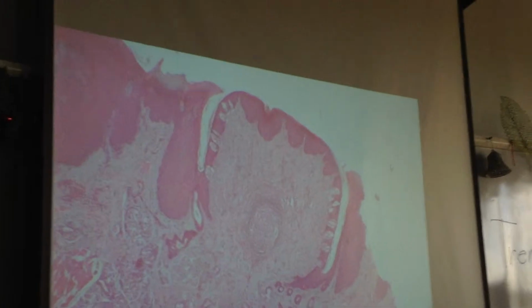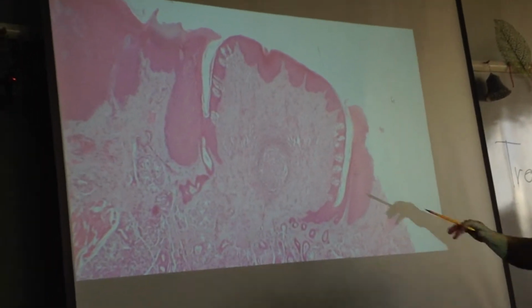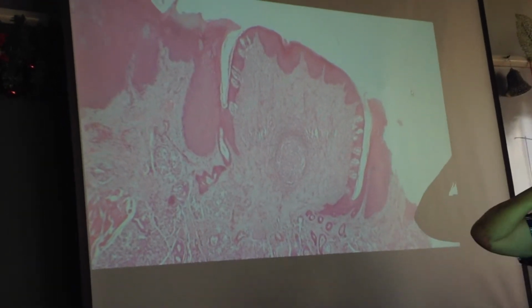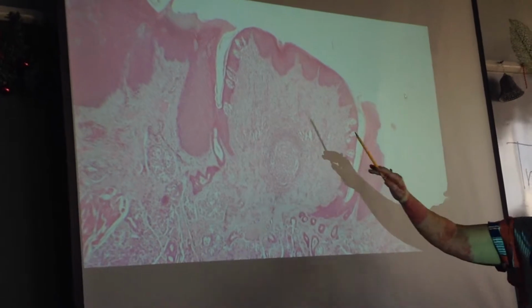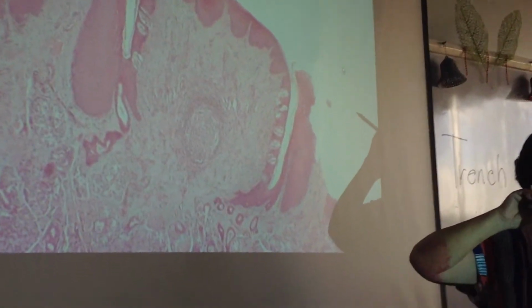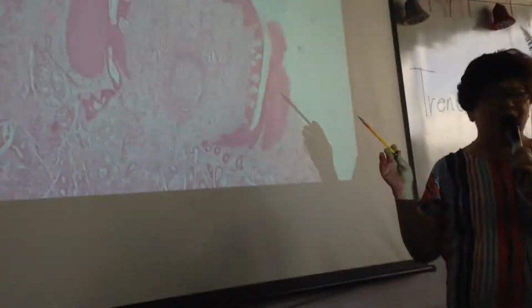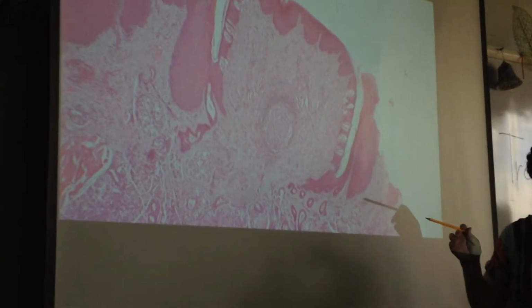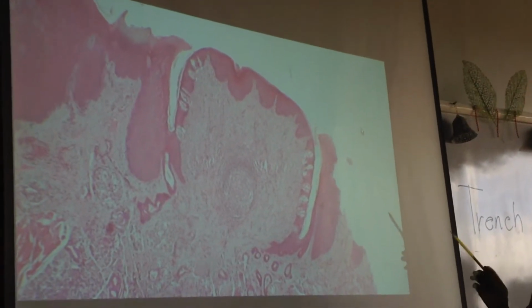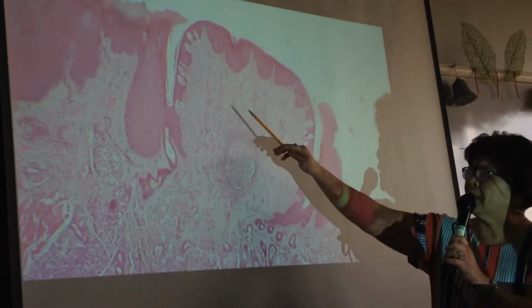The other one, we don't have any slides for the foliate lingual papilla. So the whole structure is your circumvallate papilla. This is a demonstration slide, as mentioned in our manual. This is slide 23, and this is not issued to you because there are very few of slide 23. The section has a difficulty purchasing additional or replacement slides. So, demo. This is your circumvallate papilla.